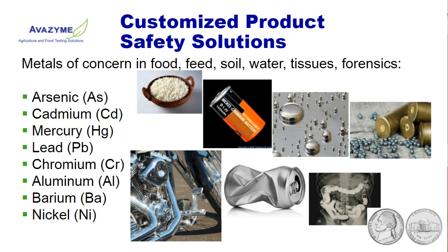How does it get in there? Sometimes filtering media like diatomaceous earth can contain high levels of arsenic, depending on where the diatomaceous earth has been mined. Cadmium is of concern. A lot of cadmium finds its way into landfills, from where it leaches into the groundwater. The main source is the rechargeable nickel-cadmium batteries that, once disposed of improperly in landfill, can lead to contamination in the environment.